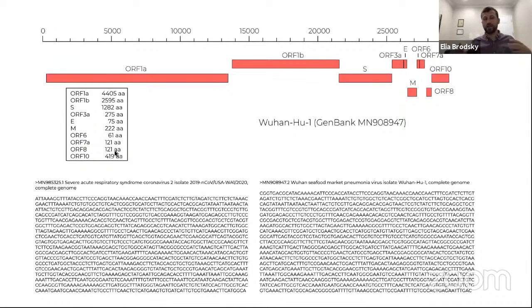And this is how they are related to each other, by these specific mutations, by these insertions and deletions, or by these sections that are completely different, right?